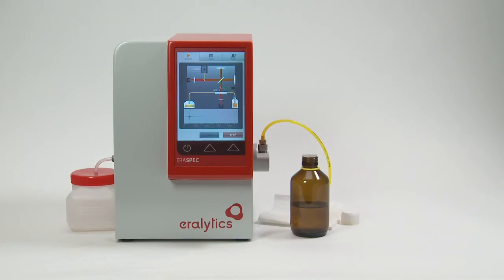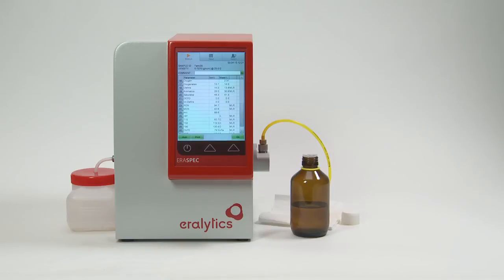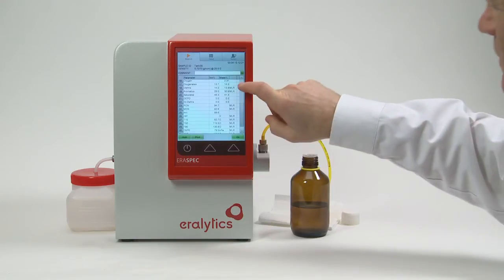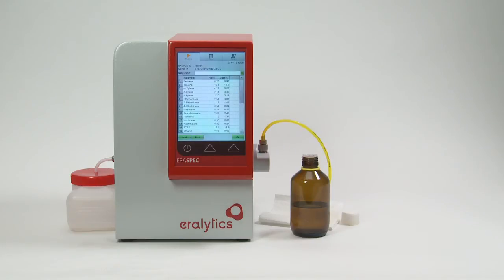At the end of the measurement, the sample is pumped out of the system and the result list is displayed. The total measurement time is about one minute. You can browse the result list using the scroll bar on the right side.